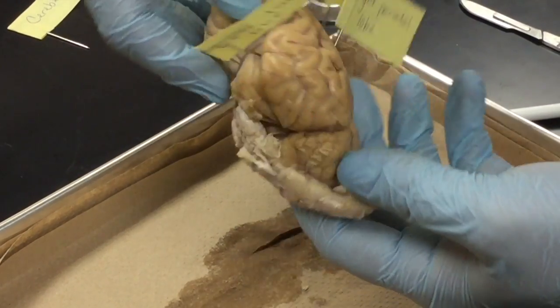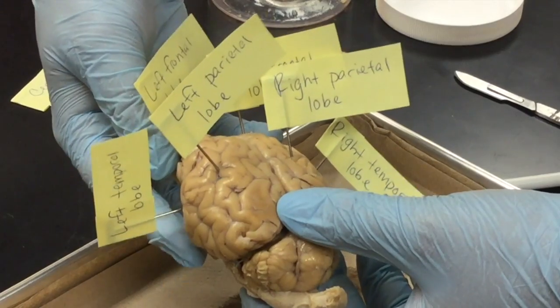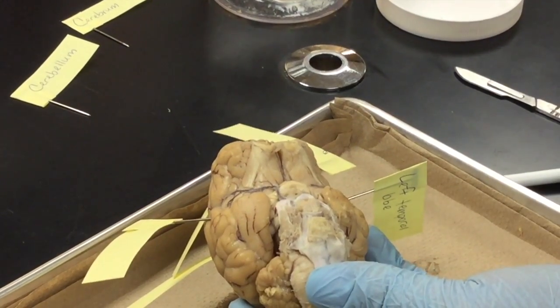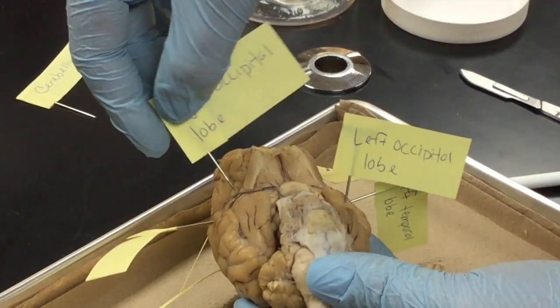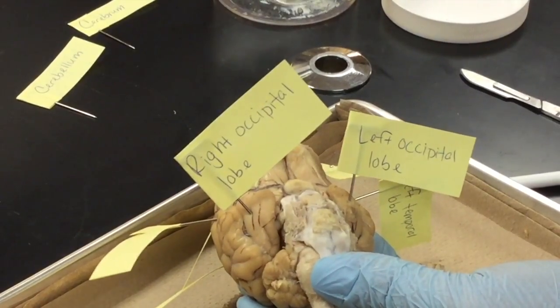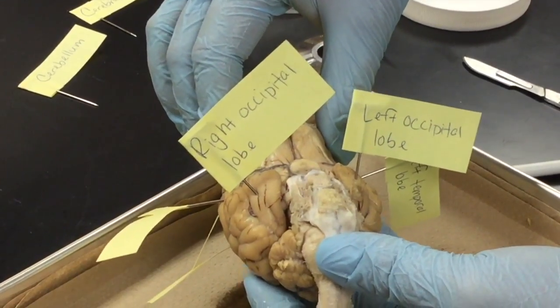Now, if you look very closely, when I took the brain and I flipped it upside down, what was on the left side now looks like it's going to be the right. So this is still going to be the left occipital lobe, and the right, which is what looks like the left, is actually the right occipital lobe. So here are the 4 different lobes of the brain.